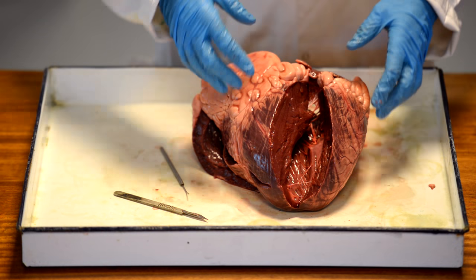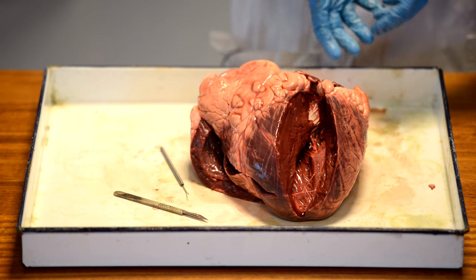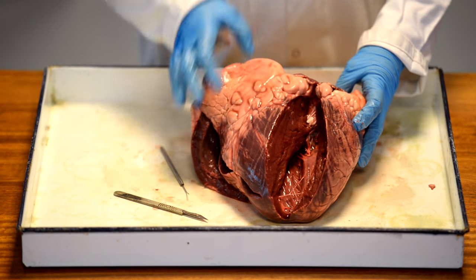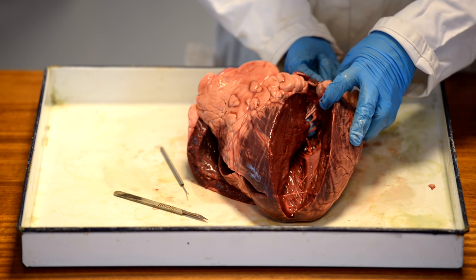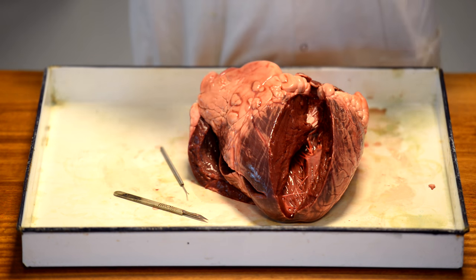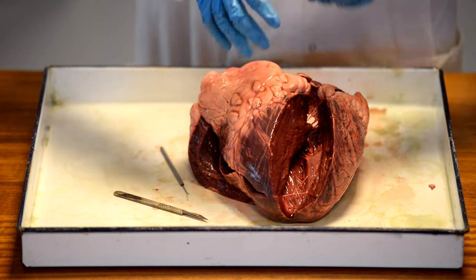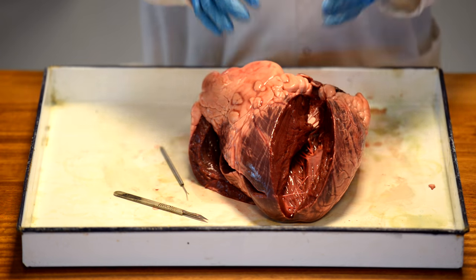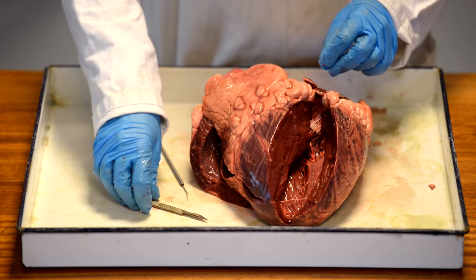So where does the blood go? The blood has come from the lungs, in through the pulmonary vein, which unfortunately has been removed from this one where they cut it off along the top, goes down through the valve. It's the only way it can go, down through the valve. The valve won't allow blood to go the wrong way. It fills the left ventricle. The left ventricle contracts and the blood is going to leave via the aorta.